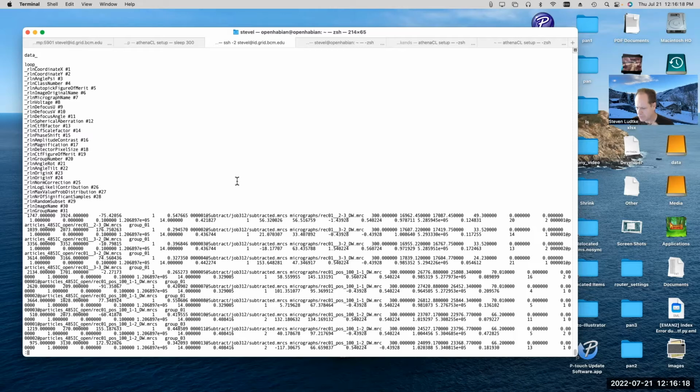The interchange format that you'll find people using, and the format that works natively with Relion, is the MRC format for the image data. Now, the metadata is not generally stored in the MRC file format because the MRC file format has a fixed size header, and what that fixed size header lets you store is not really very useful for the most part.